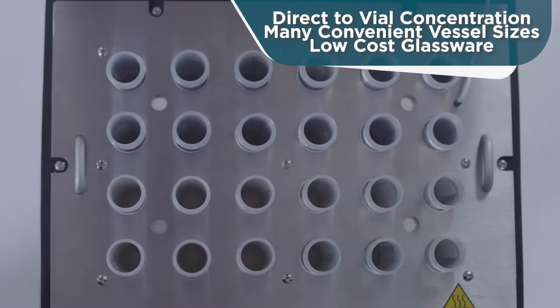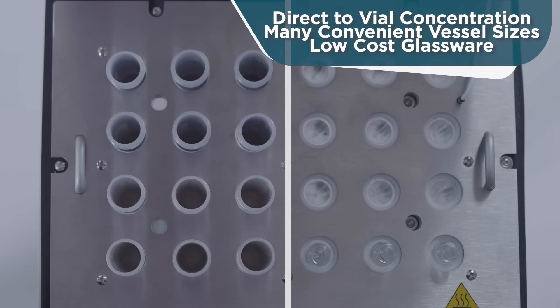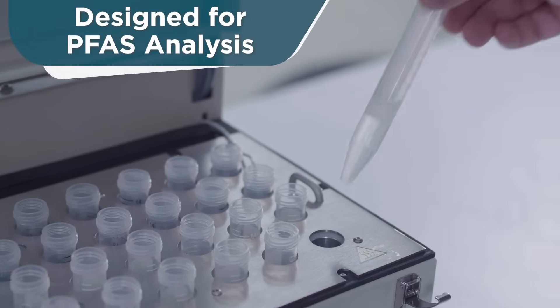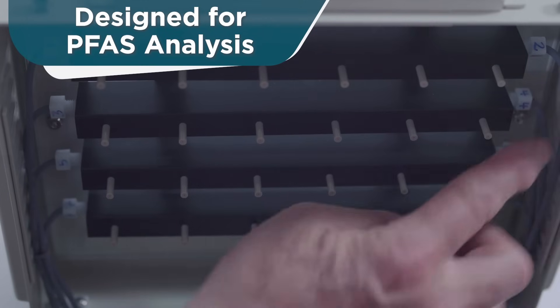The SupraVap is available with direct-to-vial termination, eliminating many manual steps that are prone to error. It is the only concentrator specifically designed for PFAS-PFOS analysis.